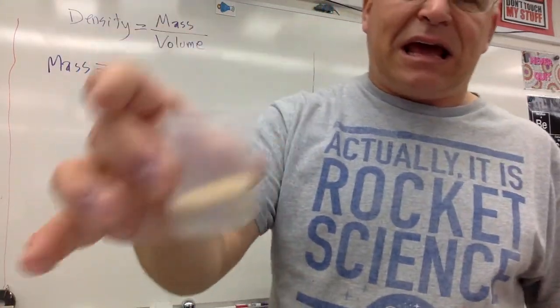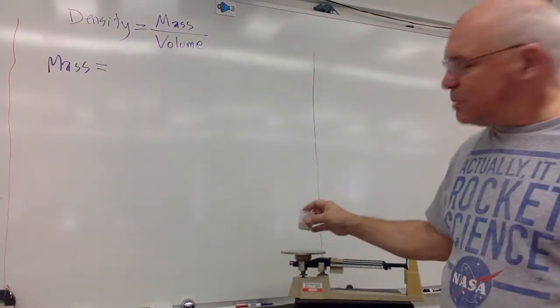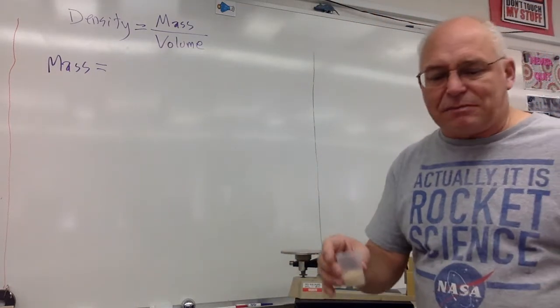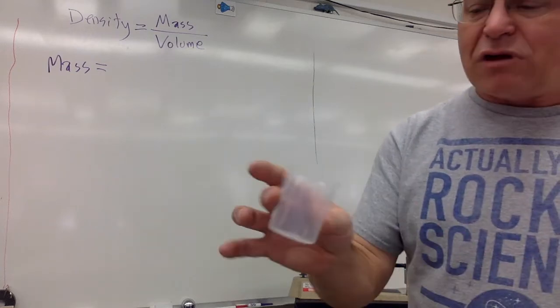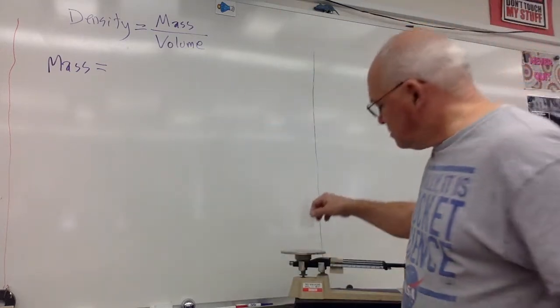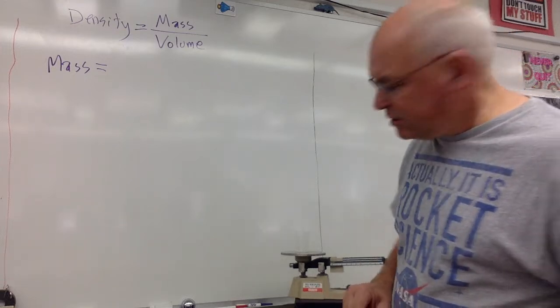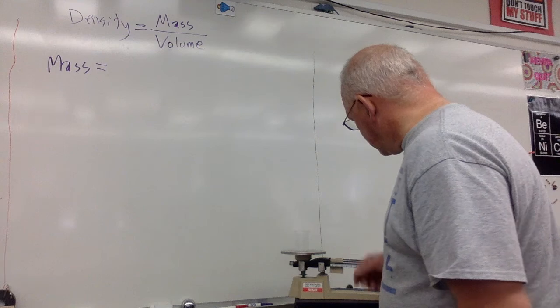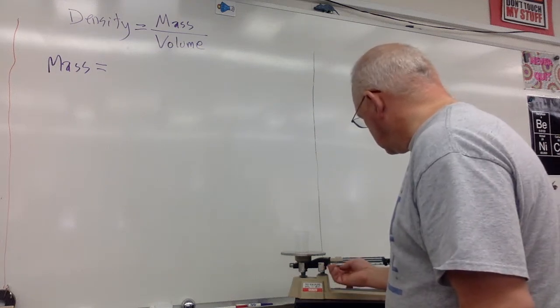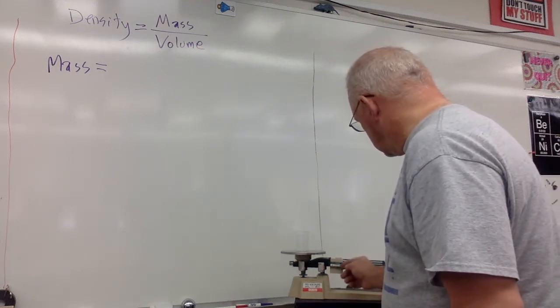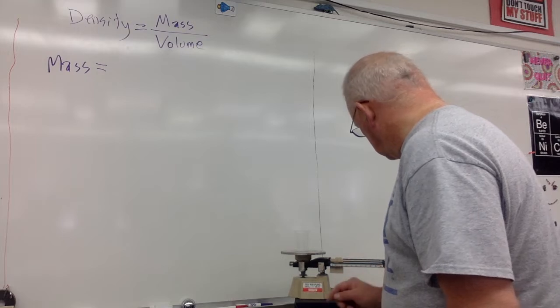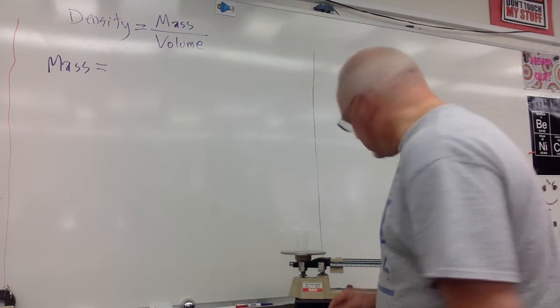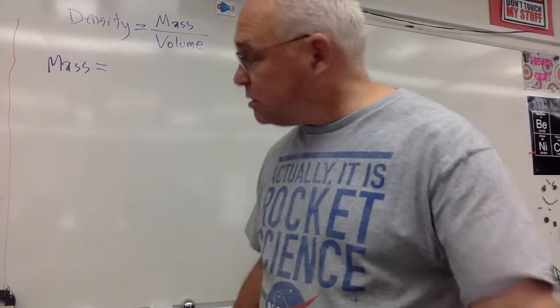So put down what information we gather. Now we need to find the mass. Again, I can't put this right on the triple beam balance because it will also have the mass of the container. So I've got to find the mass of the container so I can subtract it out. So I'm going to use this empty container and find the mass of that first. And that comes in at about 10.8.